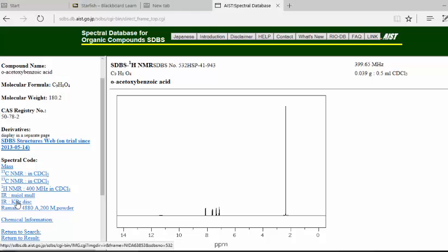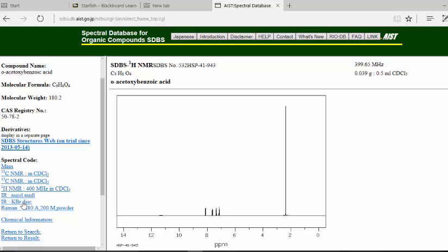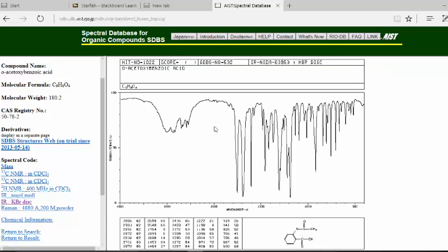If you look to the left and you want to get the infrared, you can click one of these here where it says infrared, KBr disk, just click that one and you'll see the infrared spectrum come up.